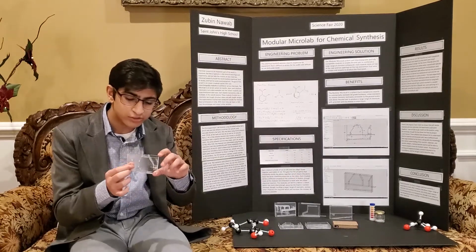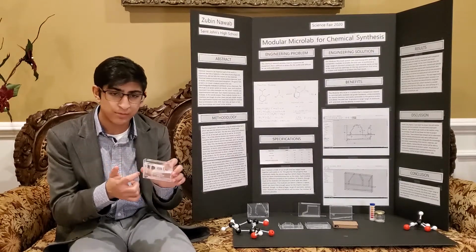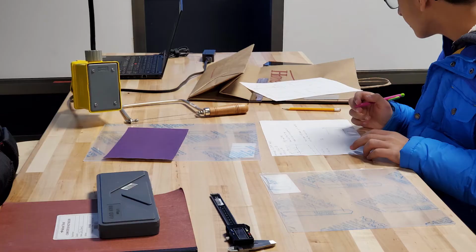This is the intake module. This is the next module. This is the mixing module. It mixes the chemicals together. Very simple. Took a lot of iterations because I didn't know exactly how to do this, and then I realized the simplest design actually worked better than other designs.